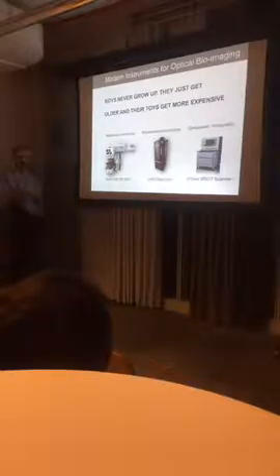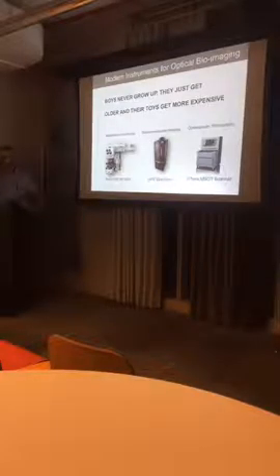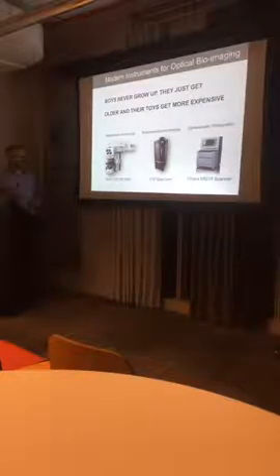But what is good with this microscopy is that we can go very deep inside, up to 1 millimeter. So the benefit of two-photon microscopy is that it can go very deep inside live tissue, and we can make three-dimensional sections, not very flat sections. But because today's topic is how to build our own microscope, I will skip it. There are many publications that we do with this microscopy, but it's not a big deal, because this is an advanced system, very expensive, requiring a lot of time and expertise.